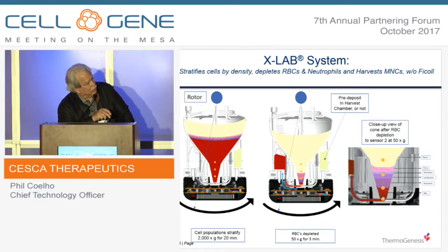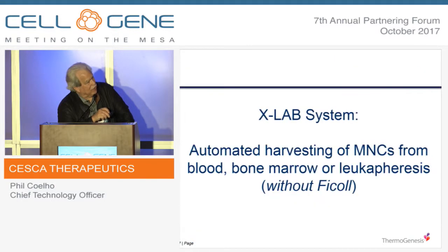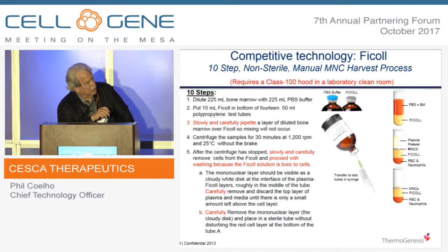The centrifuge then slows down and we passage all these cells we don't want over to another cartridge. And then even the white cell fraction lines up according to density. So we have the ability when we harvest to simply slice out the fraction that's important. For instance, the single most important area is at the start of CAR T cell manufacturing, because whatever cells you get from the patient, that's it. Things don't get better. Basically, what you lose off the original collection are cells that are simply not going to be around to expand or do anything else.